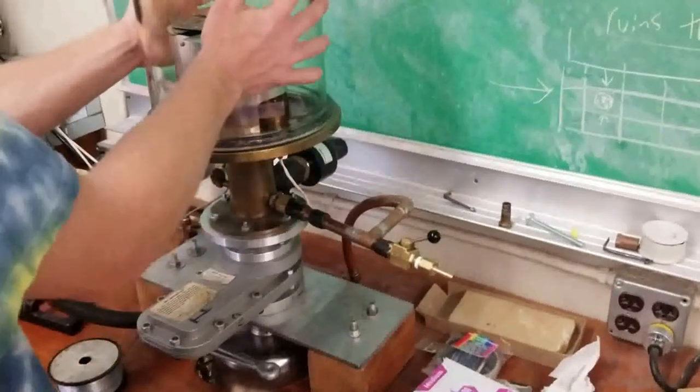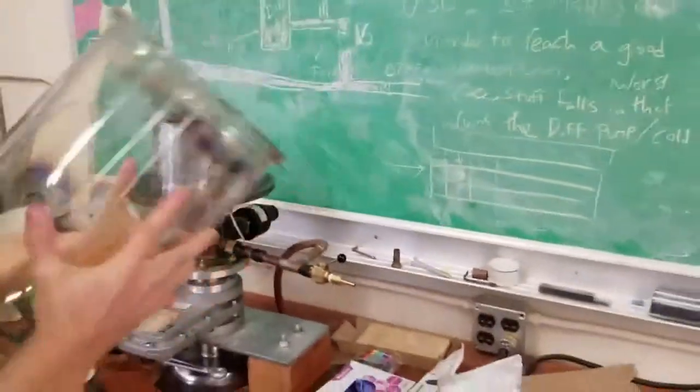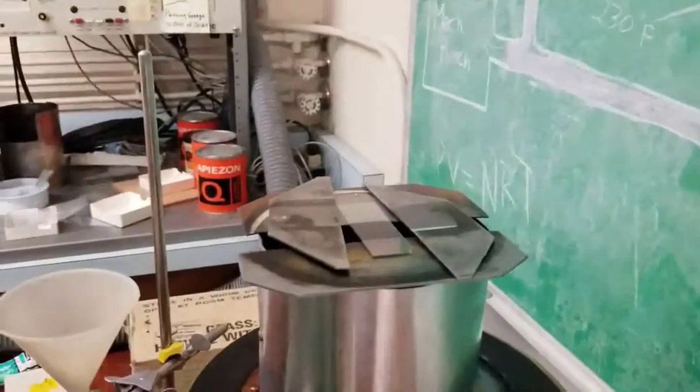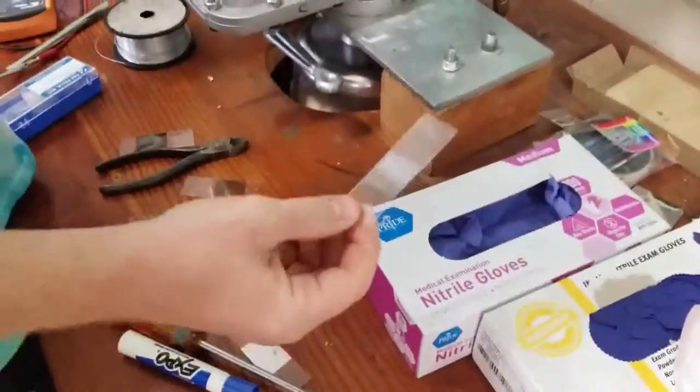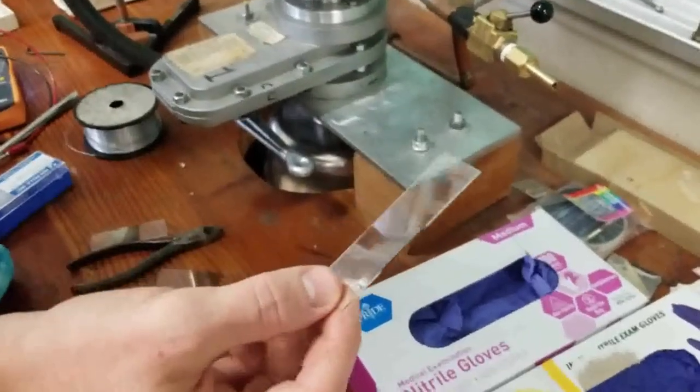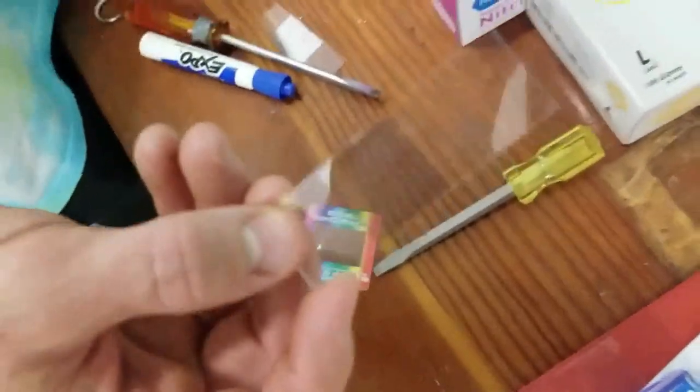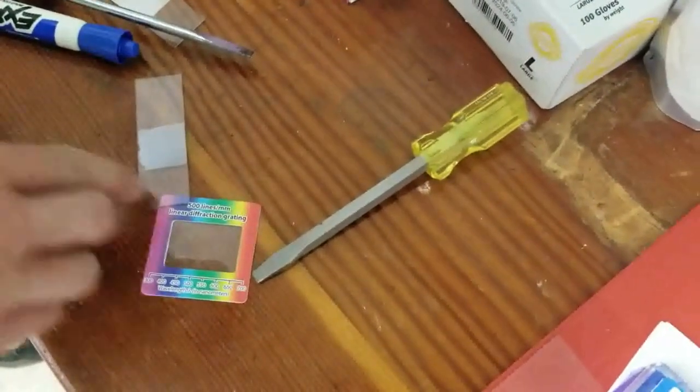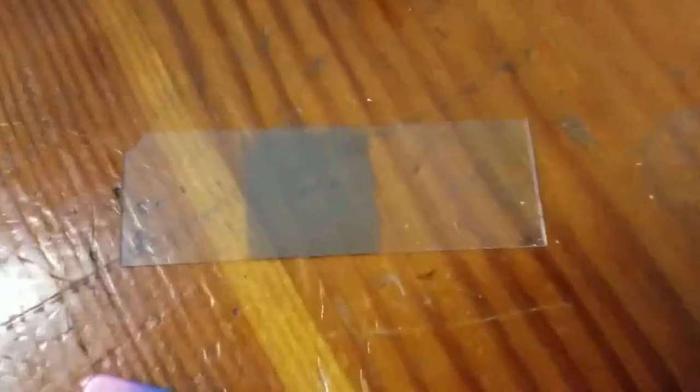So now this isn't letting any air in anymore. You actually shouldn't touch your finger to it. It may suck your finger in. It smells like burning. So I think, oh we did it! Yay! That actually kind of looks good. Yeah, I just didn't put very much aluminum in, I think. But yeah, see how on the side there's little spots that aren't, there's no deposited aluminum on it. That's what I do. I normally just touch the corner here and then nothing will get deposited here. So you can tell what's going on. Yeah, so that's pretty much it. We did it.